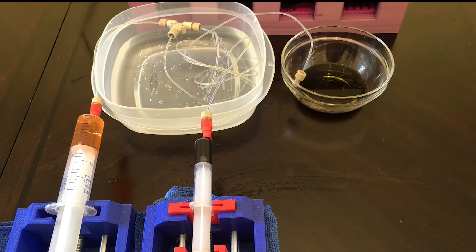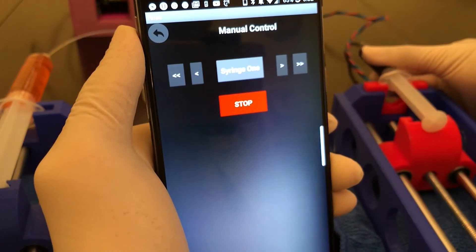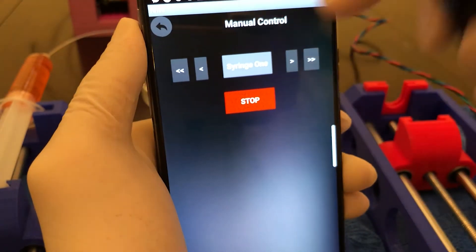For heating or cooling, you can put the tubing under a hot or cold bath. You may use our Bluetooth app to manually control each syringe pump to the desired length of the tubing.